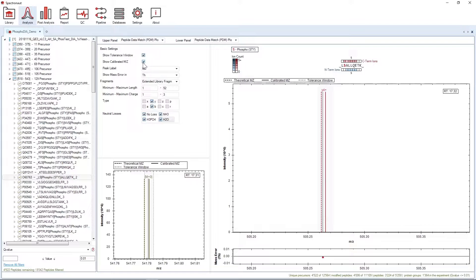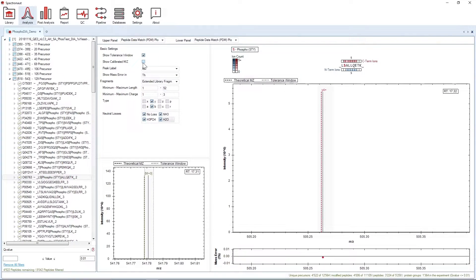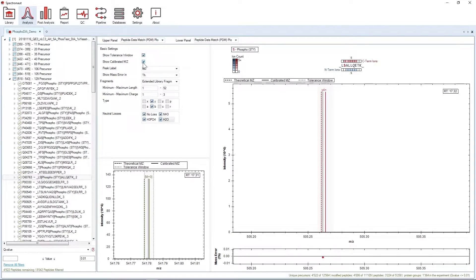The option Show Calibrated MZ indicates the fragment MZ after calibration. We usually calibrate the theoretical values to get closer to the measured values. As you can see, this also applies to both MS1 and MS2 scans.